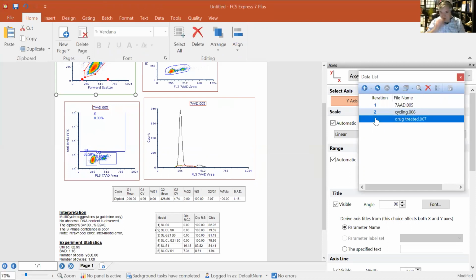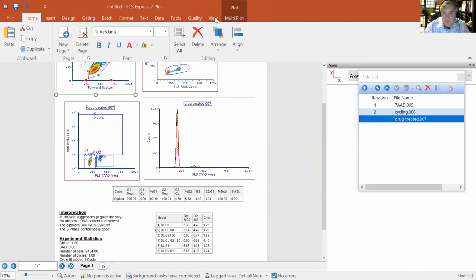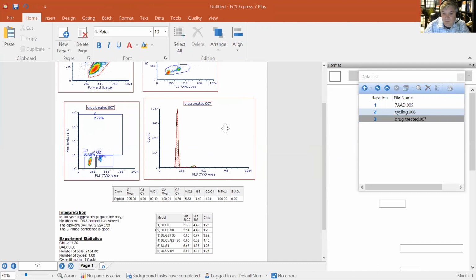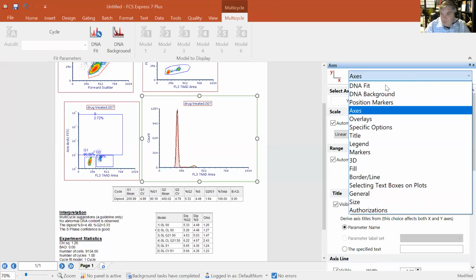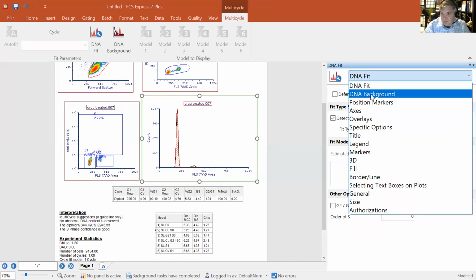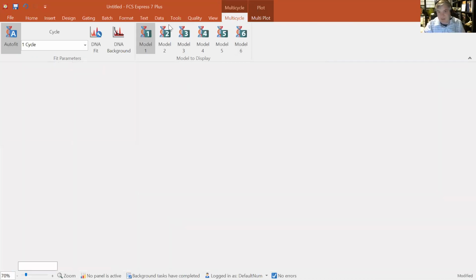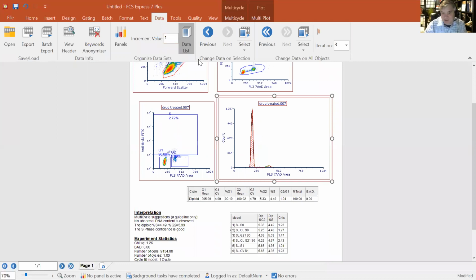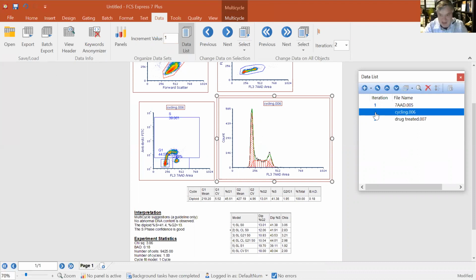And I could just add a quick comment there from a technical perspective. You want to be sure that when you're carrying out the staining and starting this experiment, you start off with the same number of cells, and that you do counts before you do your cell cycle, to make sure there's consistency across. Oftentimes people start off with a wide variety of starting cell numbers without realizing that you should be consistent, and that could cause huge shifts in data as well. Yeah, that's a really great point. And that goes for a lot of these modeling tools, even transformation tools. You want to compare apples to apples, so to say.